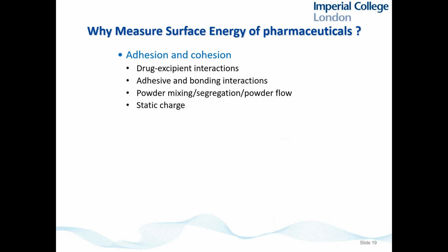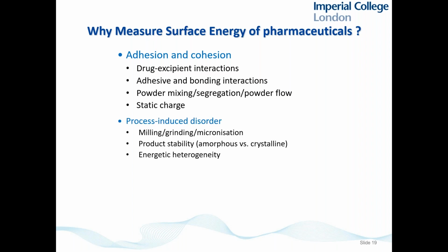So when we think about pharmaceuticals, why do we care? Well, if, for instance, drug excipient interactions, adhesive and bonding interactions, powder mixing, segregation, powder flow, static charge, surface energy is a factor in understanding those properties. Not the only factor, it's a factor. Things like particle size will be important. Static charging is important. But surface energy is one of the properties that defines some of those interactions.